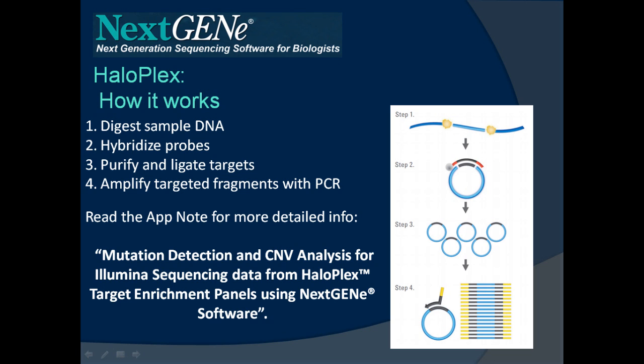For a more detailed overview, you can check out the app note on our website, Mutation Detection and CNV Analysis for Illumina sequencing data from HaloPlex Target Enrichment Panels using NextGENE Software.